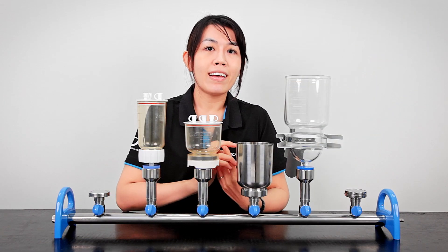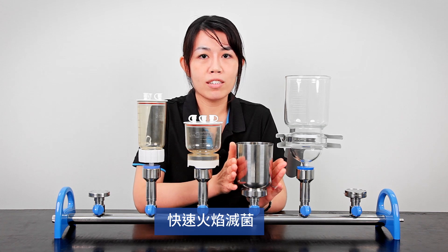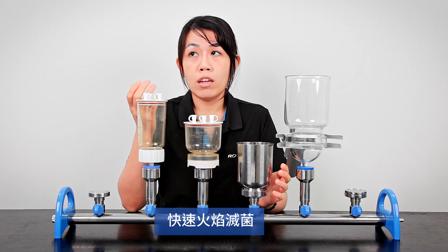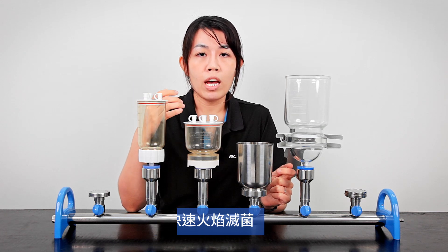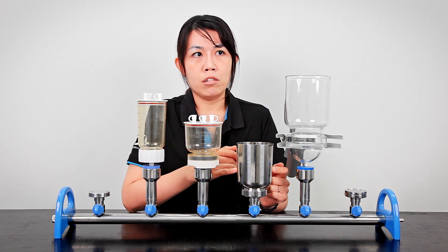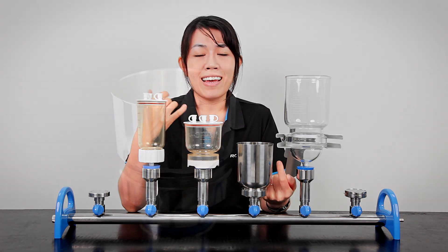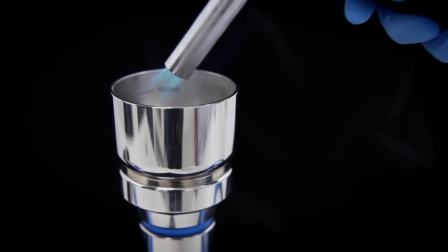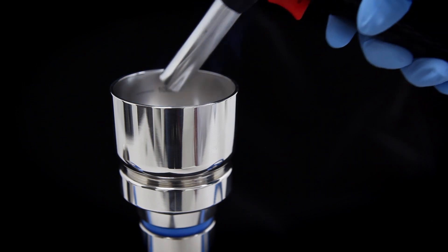One more thing worth mentioning for the SF funnel is how easy it is to sterilize. For example, if you're doing microbiological testing and need to sterilize the funnels in an autoclave oven — which usually takes hours — with the SF funnel you can simply take a torch, sterilize it with flame, and it's done in seconds.